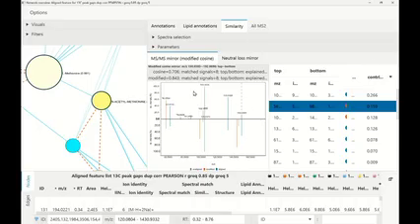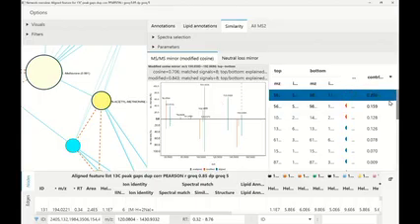Of course, if we see that the intensities of the signals are quite distributed, so there are multiple signals with similar intensities, then this is of course better, because we get a contribution to the score from multiple different signals, signal pairs in this case.